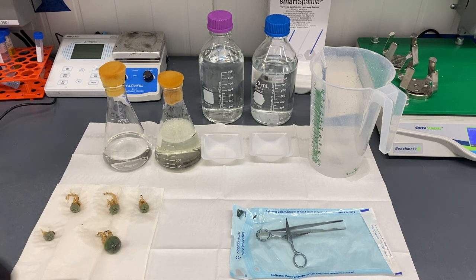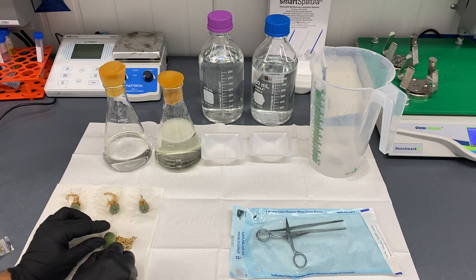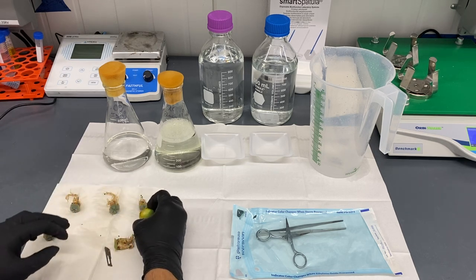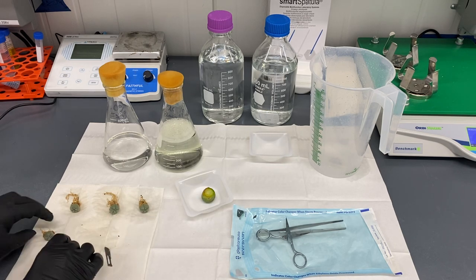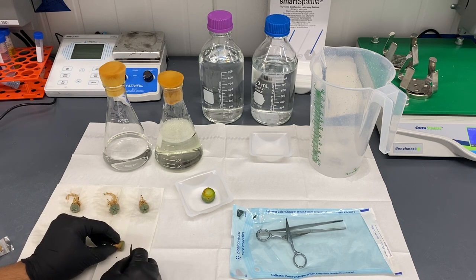We're going to try to keep the roots, so I'm going to cut right above them, leaving a little bit behind. They're going to go through surface sterilization, so I'm not too nervous about cleaning the blade in between.